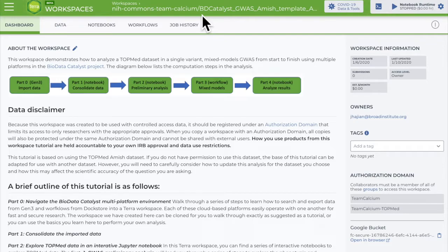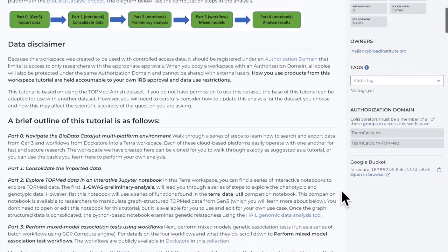Mine is in this NIH-funded billing account. Terra uses authorization domains to protect data privacy. If you're working with restricted access data, you'll only be able to share with people authorized to access the data. On the right side of the dashboard is a section listing the authorization domains a person needs to be part of for access to this kind of data. If this is blank, the workspace only uses open access data and it can be shared with any registered Terra user.